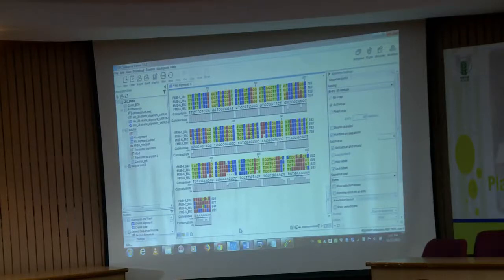This is the trimming part, 5' to 3', and in between if some variation is there, let us suppose you can find a gap, this is a gap, okay. If I just see it, I will assume that maybe it is a deletion of that particular base in my sample, but whether it is actually a deletion or not, I will have to go back to my chromatogram file and check whether after this A, again C is coming with a good peak, or some confused, blurred or mixed A is also coming.